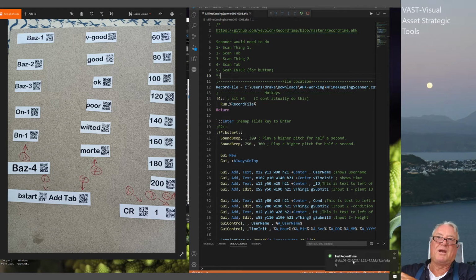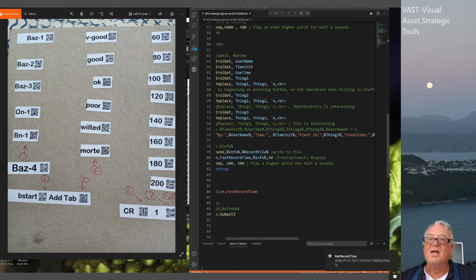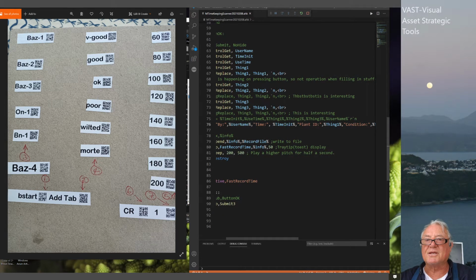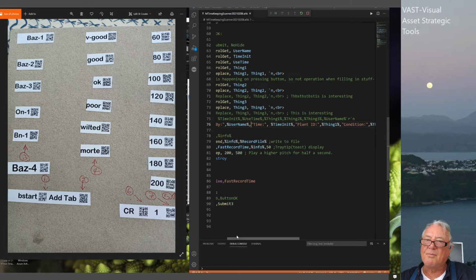So therefore I said, okay then, well, let's just throw away the intention of the process of what we're going to do. We just do it all in AutoHotKey script. So that's brilliant. We actually only have to deal with one program and actually make that work. From that program, it'll write that data to a file. And the initial file that it was doing was a text file, so I changed it to a CSV file. So the script that it sends there, it just needs to be comma delimited, so I think comma separated file, and at the very end it just needs `r`n, which is a carriage return. So it means you go down to the next line and then it starts as a new line back at the beginning again.